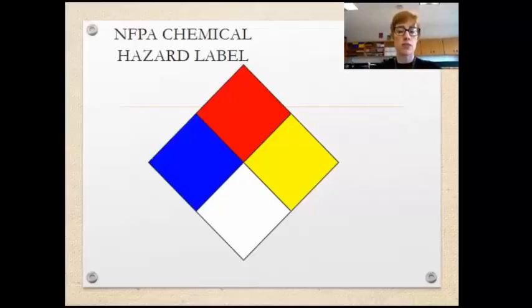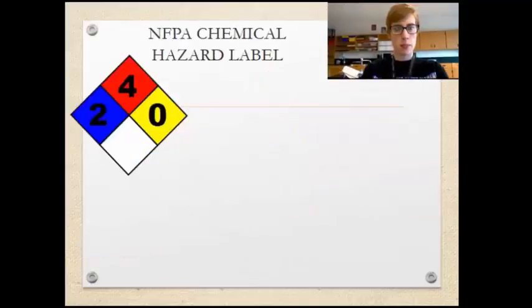Health, the blue box tells us a little bit about the health hazards of the chemical. So is it dangerous to inhale? Is it dangerous to touch? Things of that nature. And then the last box, we call it special, and that just gives us some specific hazards that that chemical could have, and we'll walk through what some of those special hazards look like here in just a second.